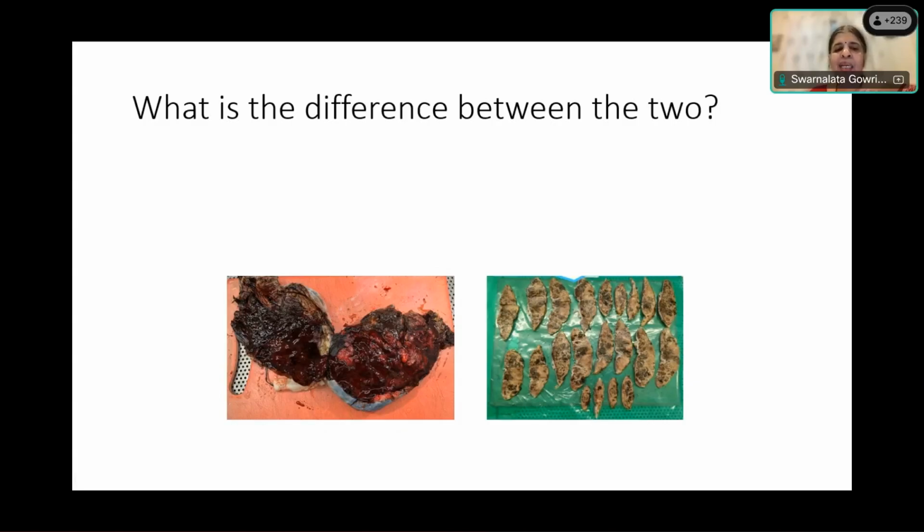The next day you take it out and then you can annotate them. You can take a picture of them and then say which areas you're taking bits from, so that later when you're reporting, you know exactly which area it represented. And these are slices which are completely well fixed, and these are ready for processing.